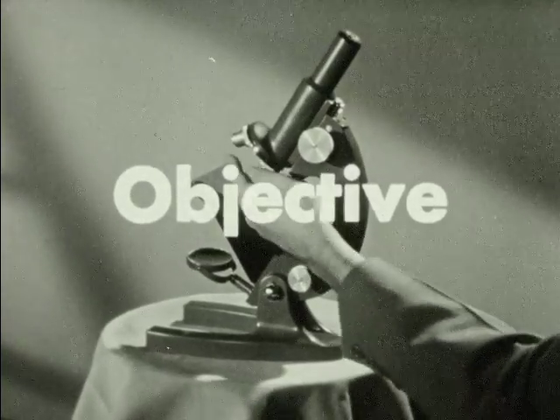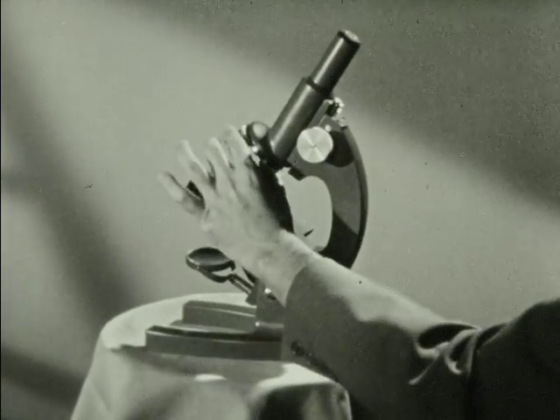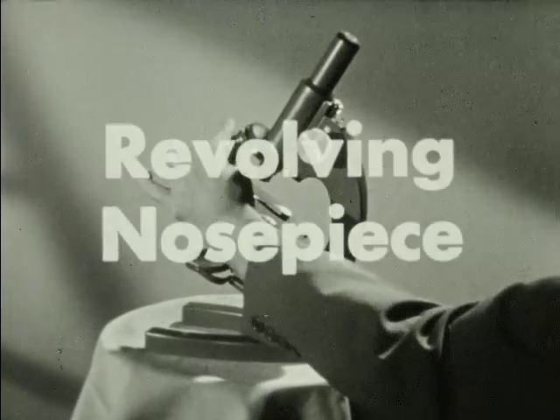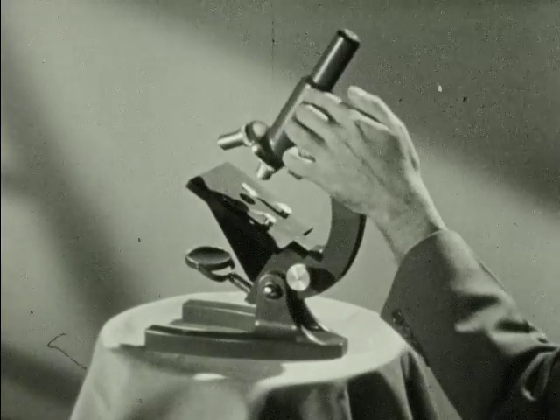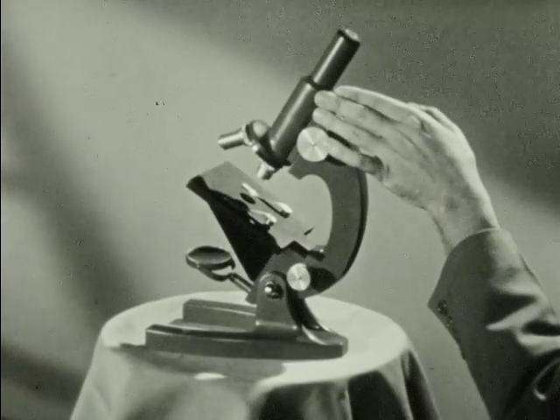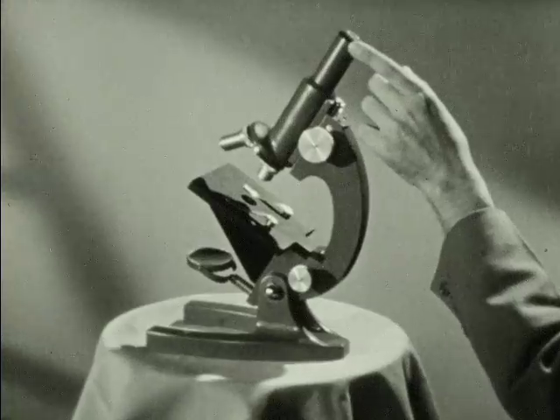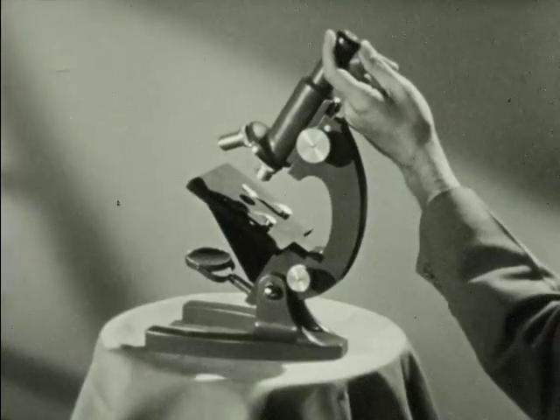The objectives are the lenses which are nearest the specimen, or slide. The objectives are attached to the revolving nose piece, which allows the objectives to be easily changed. The tube is part of the main body of the microscope, so named because of its tubular shape. The eyepiece is the lens located at the top of the tube, nearest the eye.